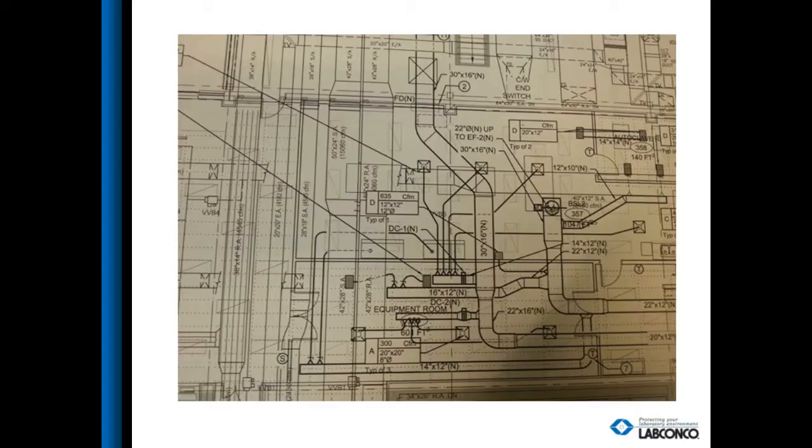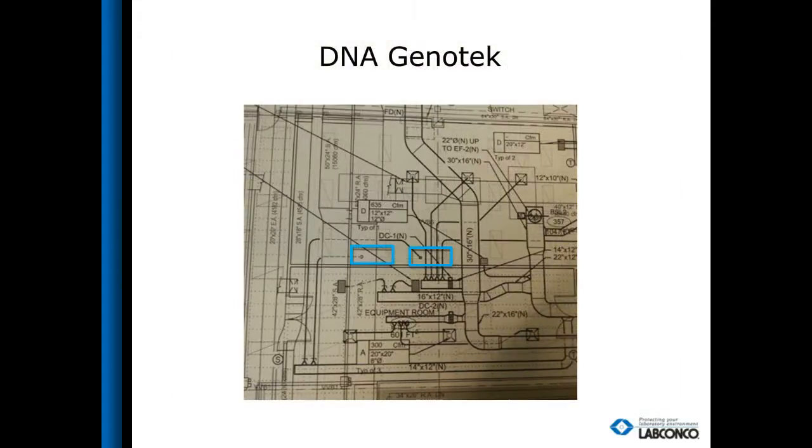Through this mess, what I was able to identify was there were 2 Class 2 biological safety cabinets that she determined were going to be type B2 bio cabinets because they were working with hazardous chemistry and very strong odors with their biology. While looking at these plans, I also noticed that they have planned the one thing that you cannot do with a type B2 biosafety cabinet, and that is to manifold or plumb them together.